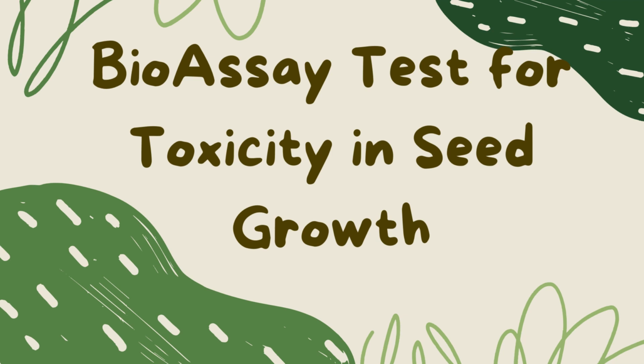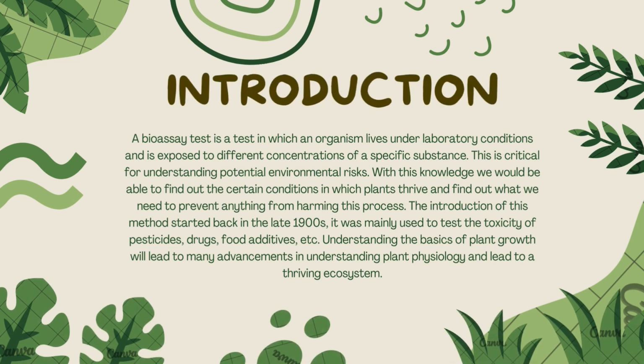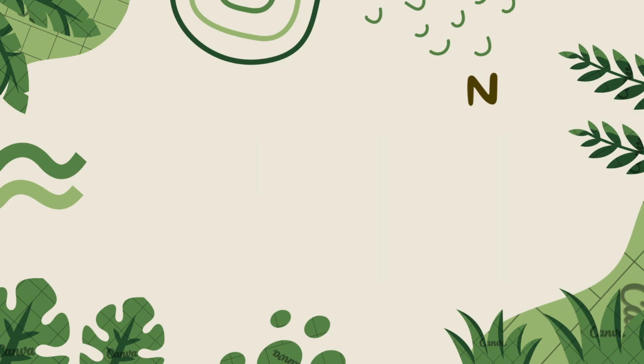My project discusses the effects of sodium chloride on seed growth through the use of a bioassay test. A bioassay test is one in which an organism is kept under laboratory conditions and exposed to various quantities of a specific chemical. This is crucial for assessing potential environmental threats. With this knowledge, we will be able to identify the specific conditions under which plants thrive and determine what we need to do to prevent anything from interfering with this process. Understanding the fundamentals of plant growth will lead to significant breakthroughs in plant physiology and lead to a thriving environment.